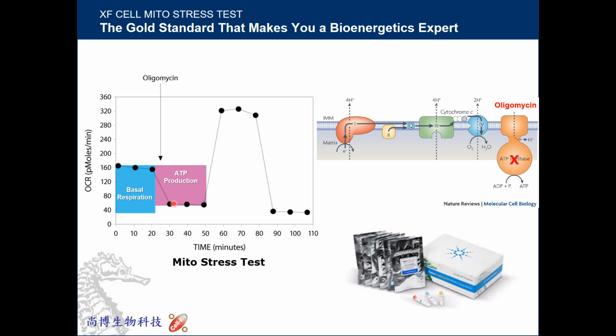It is combined ATP from mitochondria and ATP from glycolysis. You cannot tell how much is from mitochondria or how much is from glycolysis. But with this design, we can know the ATP production from mitochondria, and it is the only instrument to know it. It is very important.